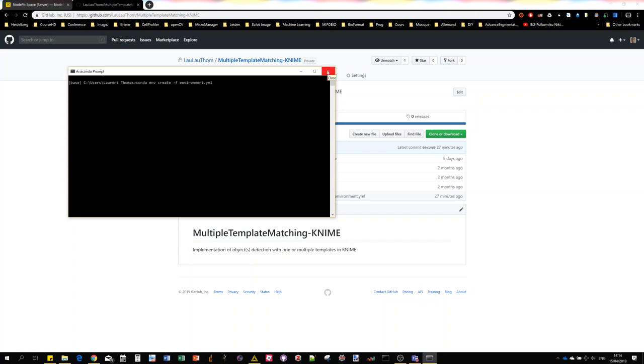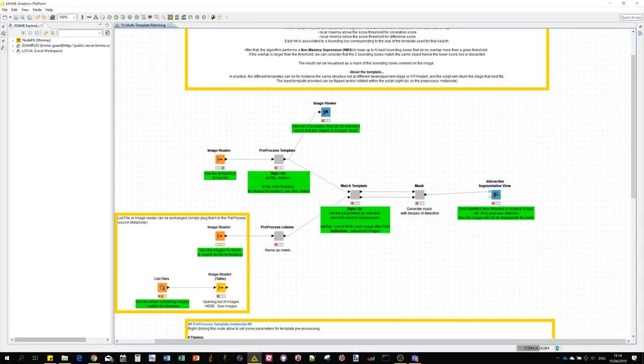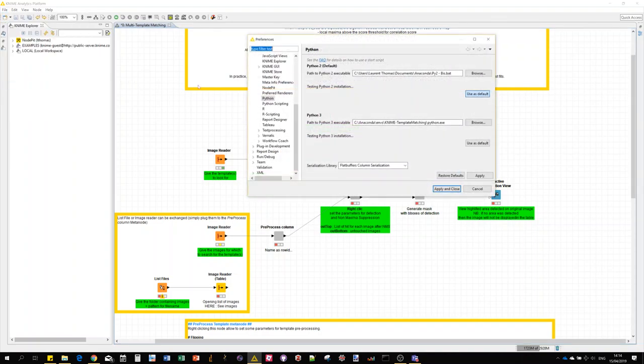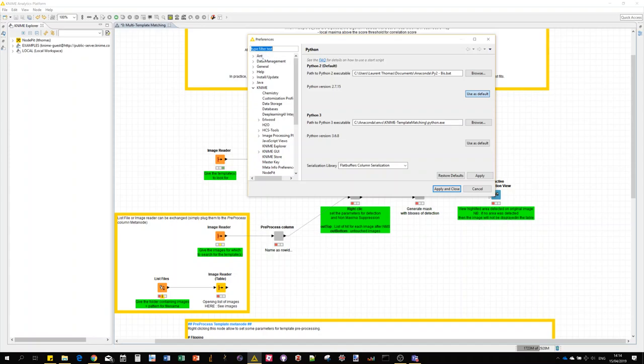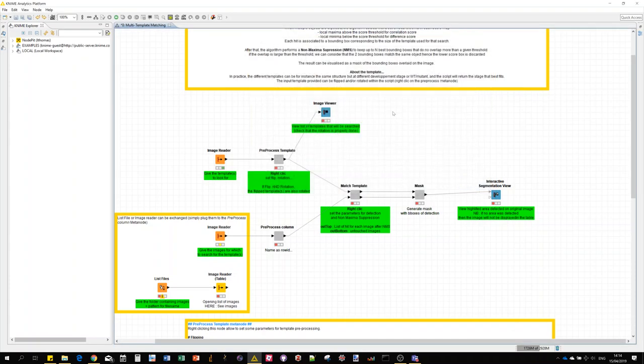Then if you hit enter, Anaconda will automatically create a new environment with all dependencies. Finally, the last step is to actually tell KNIME where to find the Python. For that you go here, KNIME Python, and then Python 3, and you point to the executable which should be in a folder of Anaconda and the name of the environment. Once you have that, you're pretty much ready to go.